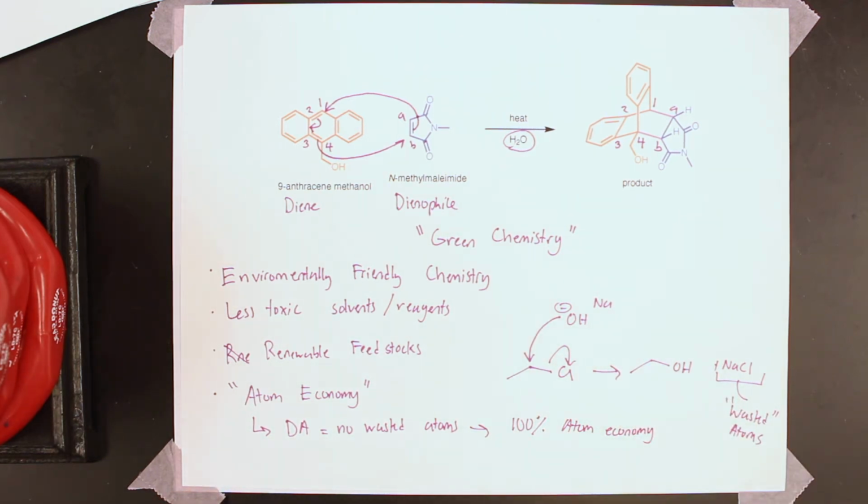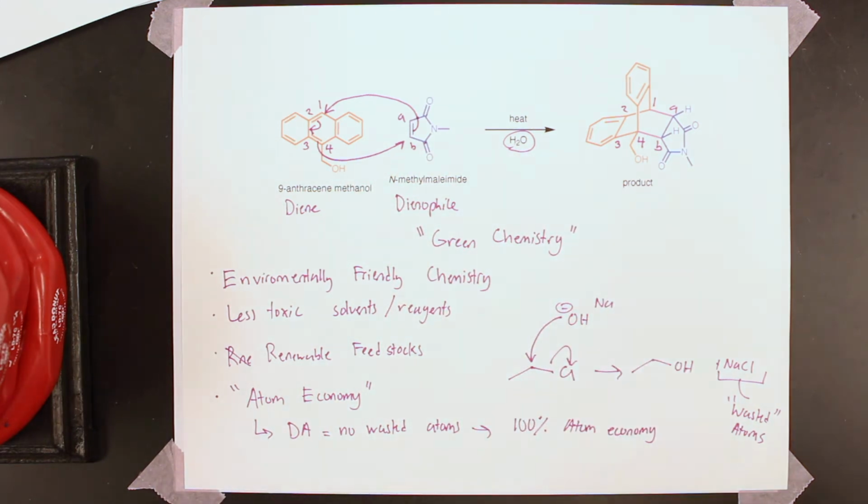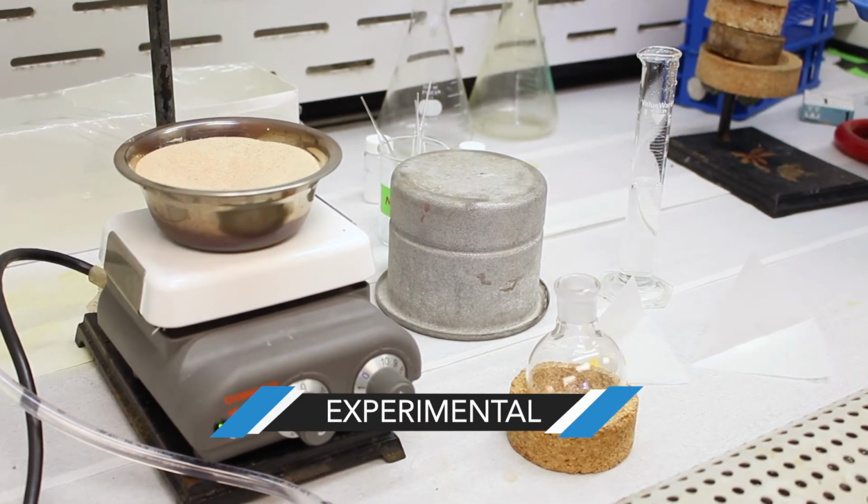Okay, so with that note, we're going to carry on to the experimental portion, and we'll see how we actually perform this reaction in the lab. See you then. All right, so welcome to the Diels-Alder reaction.